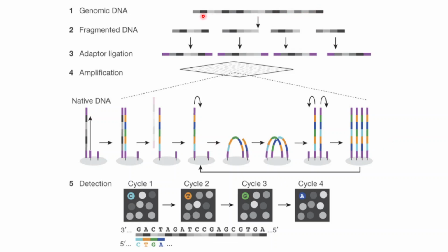So, if you have an organism like E. coli, you have genomic DNA present within it, right? In order to know the whole sequence of the genomic DNA, you have to extract the genomic DNA first, then fragment the DNA and do a next generation sequencing analysis or Illumina sequencing. So how the whole process works in between is a completely different process if you look into much more depth at how NGS sequencing analysis works.